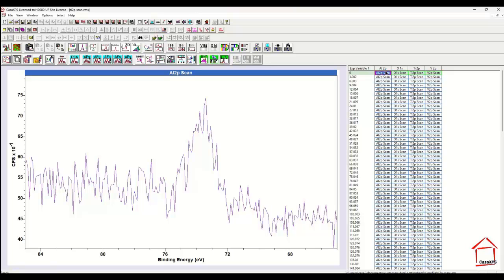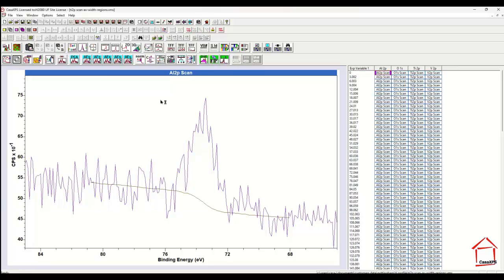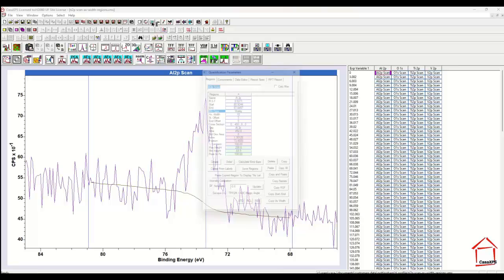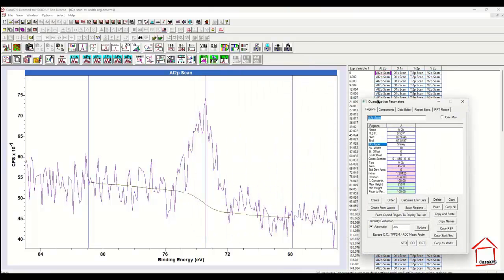And from these spectra, we would like to calculate a profile that indicates how these different elements vary as a function of depth. The way we would construct a depth profile is to define a background using the quantification parameters dialog window, and then integrate the signal above the background for each one of these spectra.